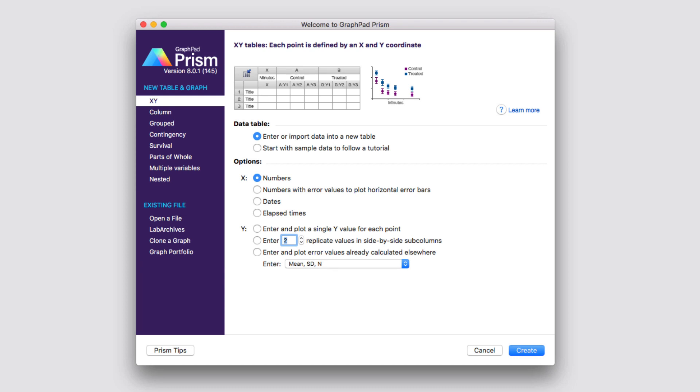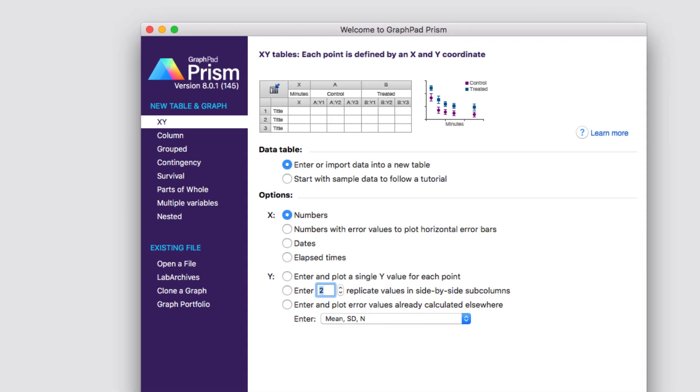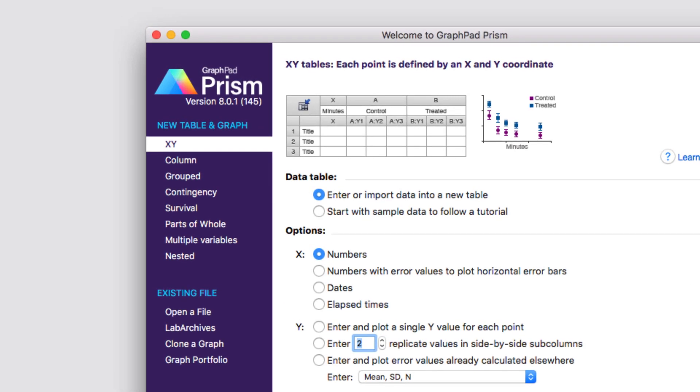Two easy ways that you can do that is to check out our video on the eight types of data tables, or you can use a tutorial data set. Each of the data tables in Prism comes preloaded with a set of tutorial data that you can use to understand how the tables are structured and how to perform different analyses within those tables. To access the tutorial data sets for any of the data tables, simply select the data table that you'd like to work with, and then choose the option Start with sample data to follow a tutorial.